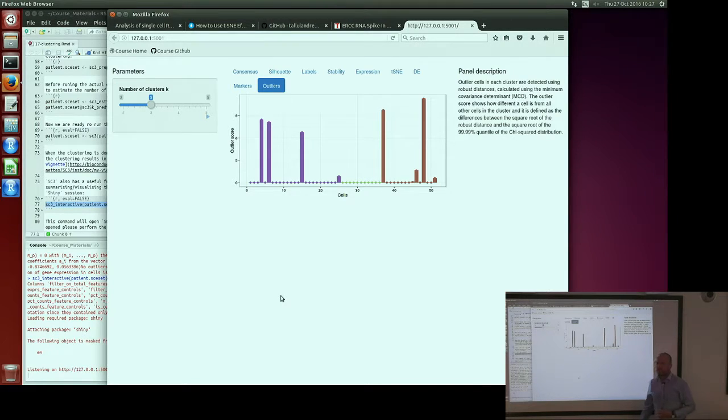Is it possible to adjust? Yes, so you can control this parameter. If you reduce this, you will see other cells that will have some other values which will not be 0, but they will be lower than these ones.